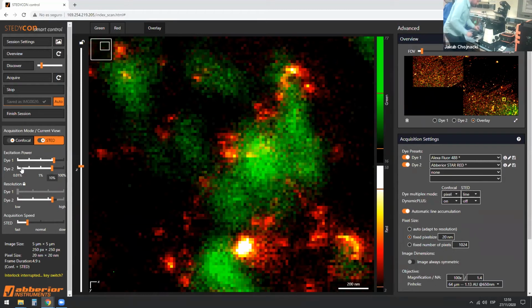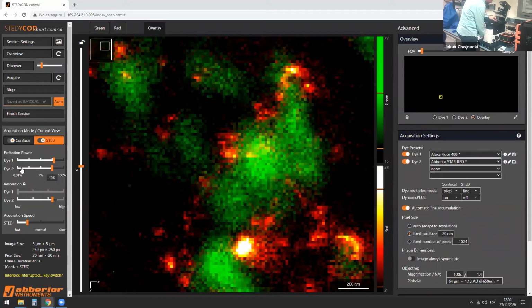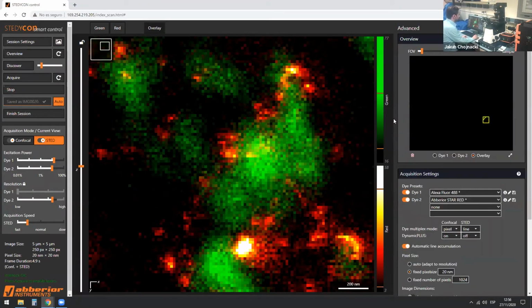Once again, I'm going to put the oil on the surface of the cover slip where the virus particles are. The virus particles obviously are on the inside part of the cover slip. We're going to put it here again, like before, and move the stage a little bit. And like before, I'm going to first look at the image using the ocular, just to focus the sample a little bit.